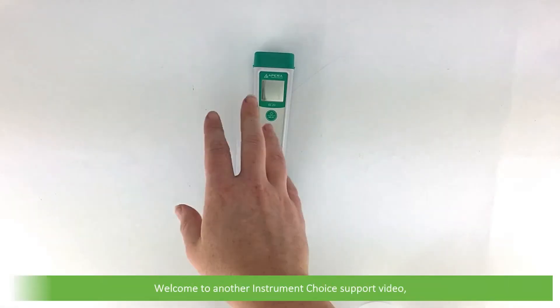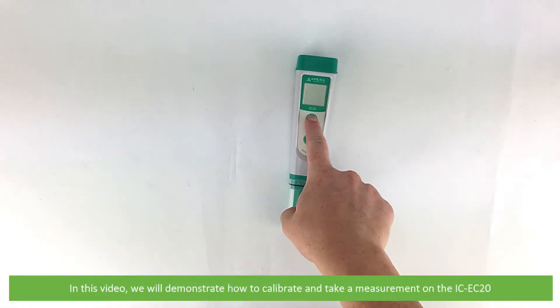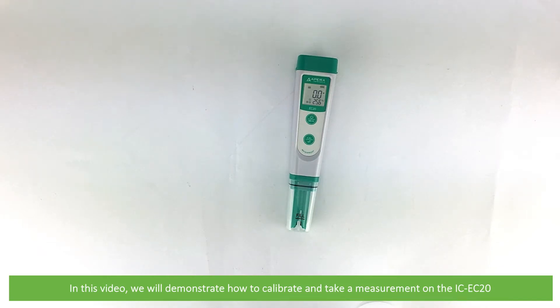Hi and welcome to another Instrument Choice support video. In this video we'll demonstrate how to calibrate and take a measurement on the IC EC20.